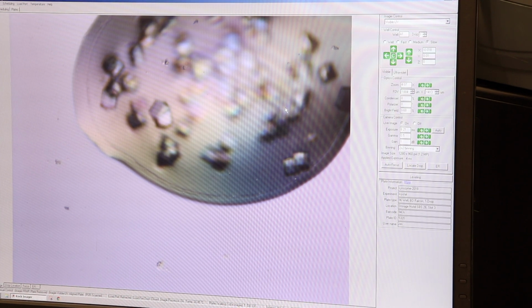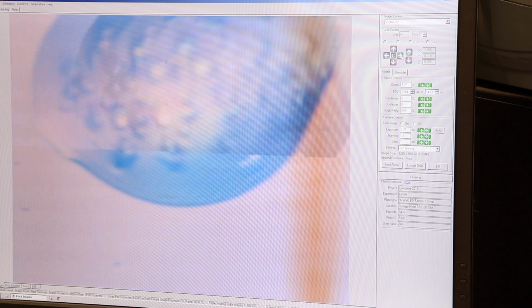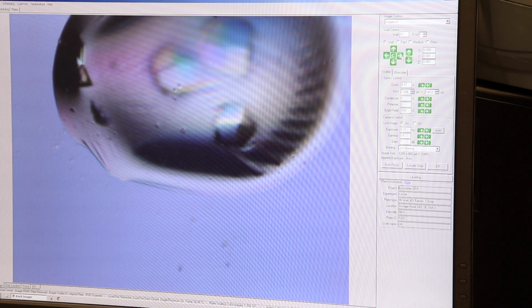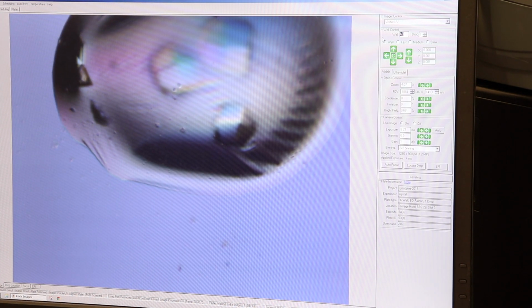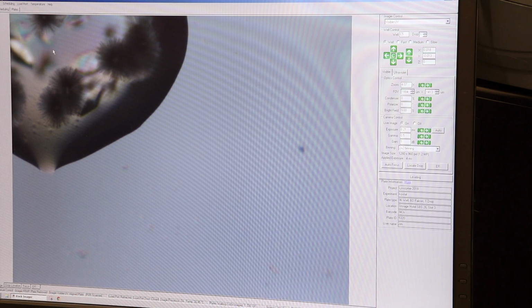So let's go to a well that I really wanted to look at, which was C5. So you can navigate wells either with the arrows, if you have this set to well, so A2, A3, or you can just type in the well, and it'll go down to that one. That's a little off center here, so we can either move the position of the deck.